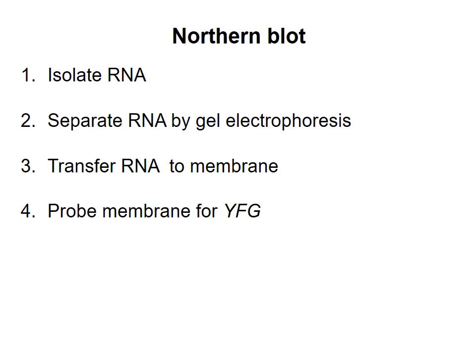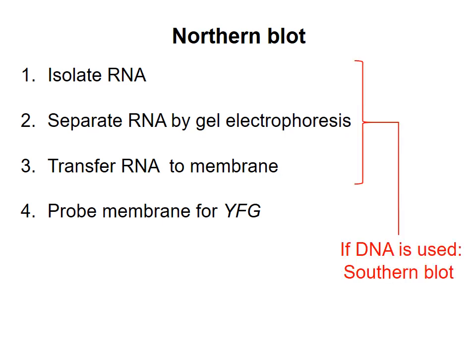There are multiple ways to do that. To start, I'm going to describe northern blotting. In this procedure, you isolate all the RNA from the cell types you want to test. Then you separate the RNA by gel electrophoresis and transfer the separated RNA to a membrane. Finally, you probe the membrane with an oligonucleotide specific to your favorite gene. In principle, you could do the same steps to analyze DNA instead of RNA — if you use DNA, the method is called southern blotting, after the scientist who first developed the procedure, Edwin Southern. The name northern blotting is a play on words of the original term, southern blotting. We have ways of specifically isolating RNA from cells, but we're not going to worry about the details of that for this course.